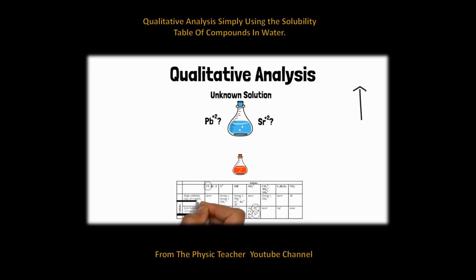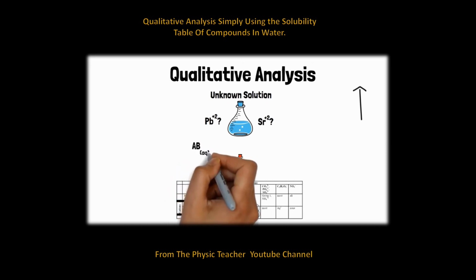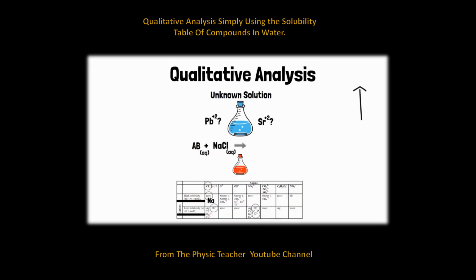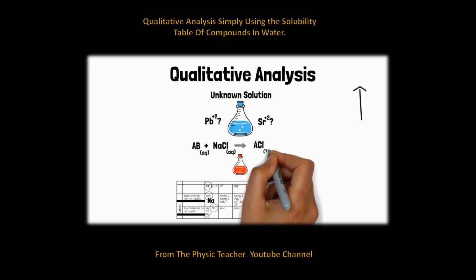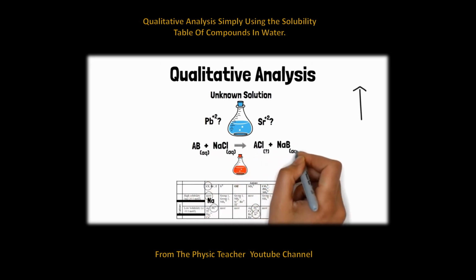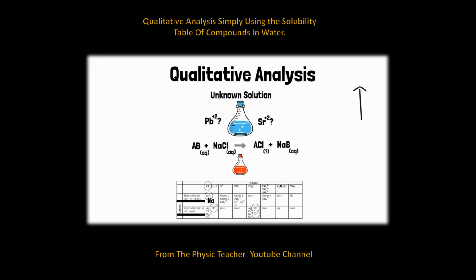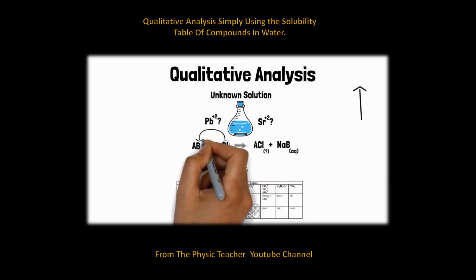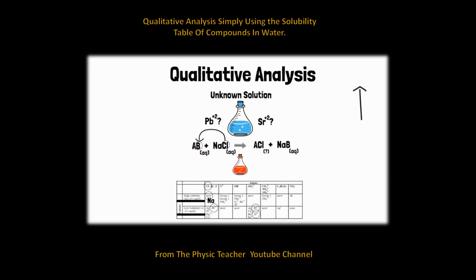So, what can we combine with chlorine then to make a solution? We need something with high solubility. Keeping it simple, using alkali or group 1 metals work best. Let's use sodium chloride. When we look at the double displacement reaction with unknown solution AB and known solution sodium chloride, the metal A combines with chlorine, and sodium combines with the nonmetal B. Since sodium is from group 1, it doesn't matter what B is, as it will be highly soluble.